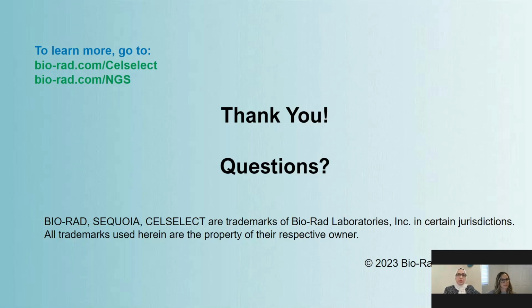The second question was about the number of cells. As I mentioned, the Celselect slide does have over 56,000 chambers. So we're not exactly sure what the maximum number of cells is, as long as the chip is not getting saturated or processing thousands of CTCs, I guess they are fine. We have shown a couple of thousand CTCs per ml using our platform, no problem, no clogging, no issues. So I hope I answered that question.